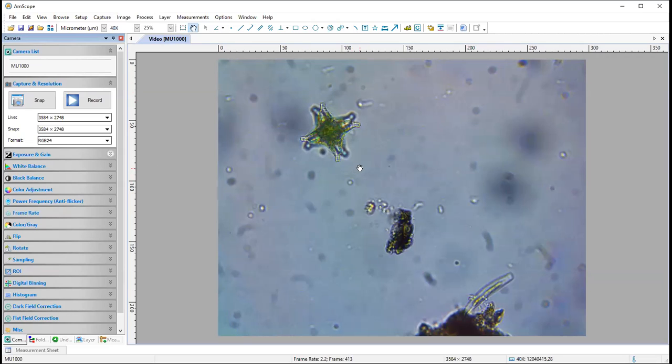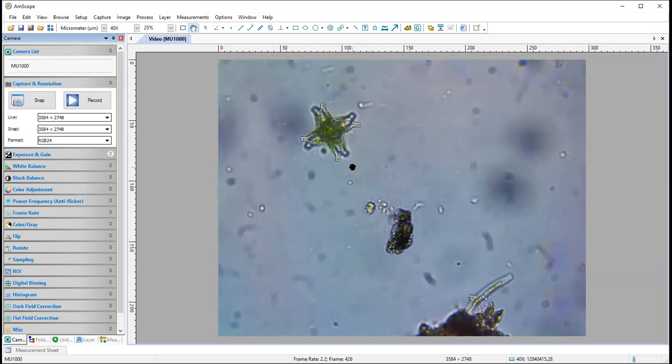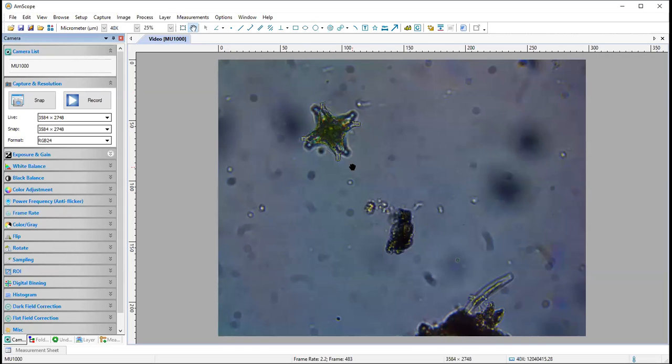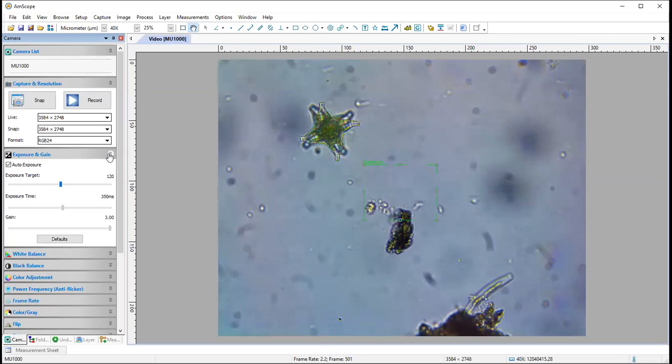So the brightness of the picture depends on a couple of different things. You might want to adjust the actual light intensity, which you can do with this little scroller on the side of the bottom of the microscope. You can also adjust light intensity and contrast with the aperture that's above that light source. So I'm moving that now. You see that it can get darker but more contrasty, so you can adjust that so that it shows what you want to show. And leave it here.